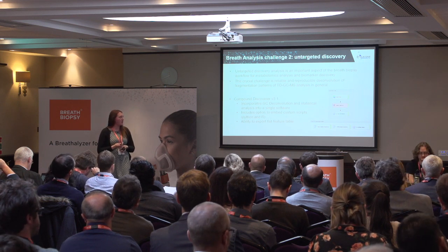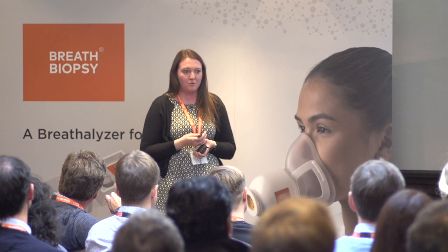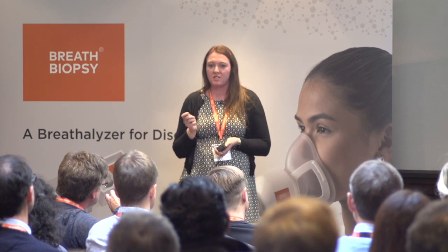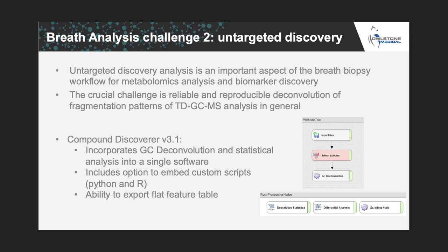So we've partnered with Thermo to beta test the new software Compound Discoverer, which has been around for a while. The new aspect in the 3.1 version was the incorporation of the deconvolution software into the statistical analysis. So we have a single software for our untargeted approach. It also includes the option to embed custom scripts, such as Python and R, which was very valuable to Owlstone as a lot of our statistic packages are built on Python and R.